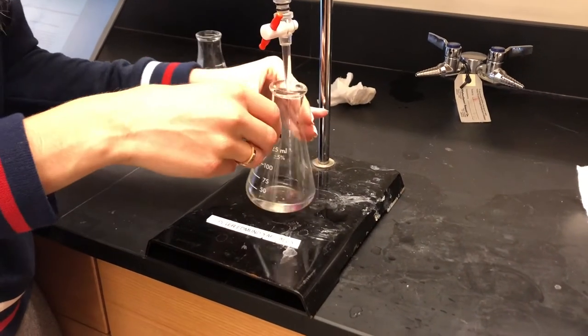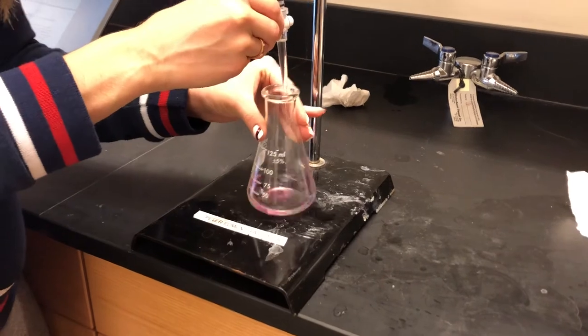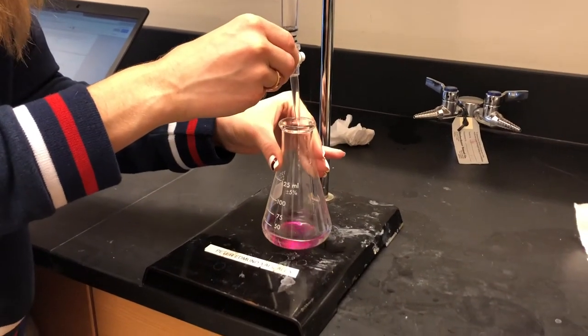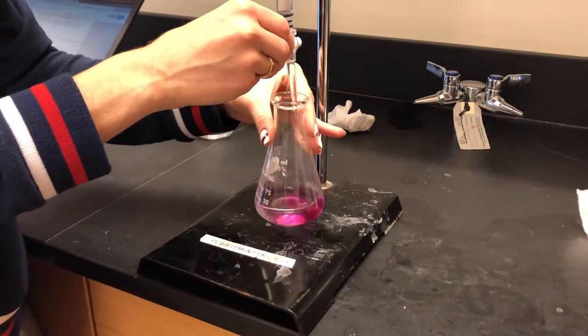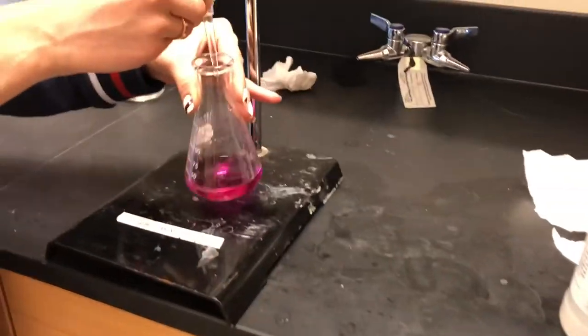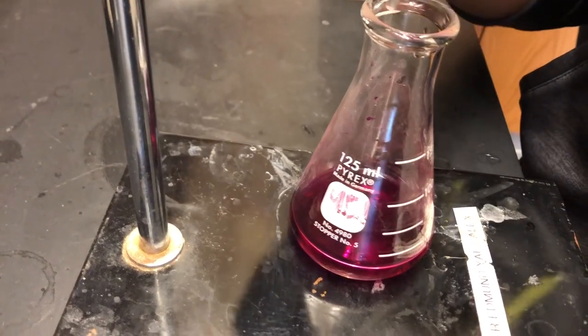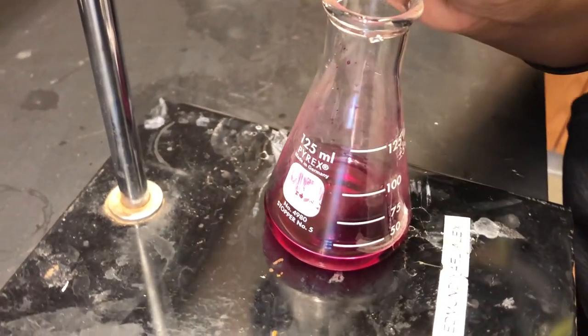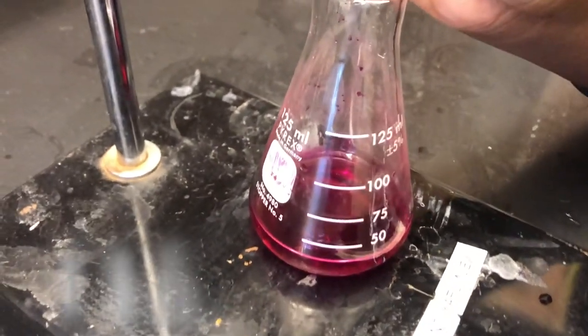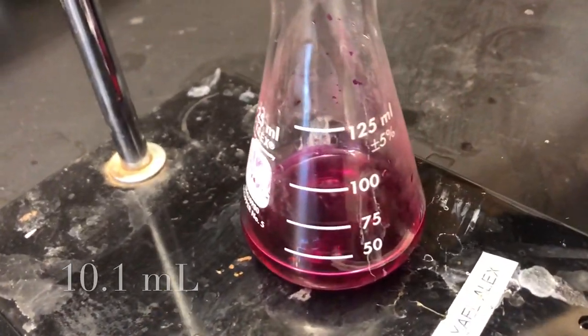Slowly add sodium hydroxide to the flask while swirling it. Stop adding it when the solution turns pink and stays pink. Record how many milliliters the solution dropped as the final volume of your titration. In other words, end volume minus start volume. Our volume of the titration that we recorded, for example, was 10.1 milliliters.